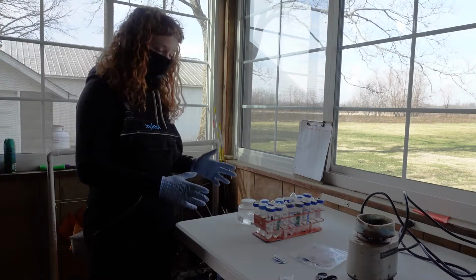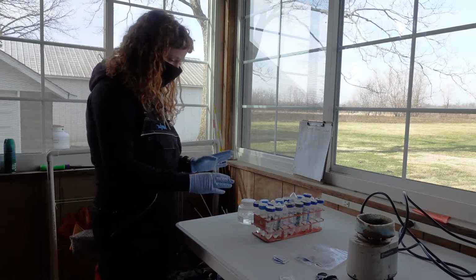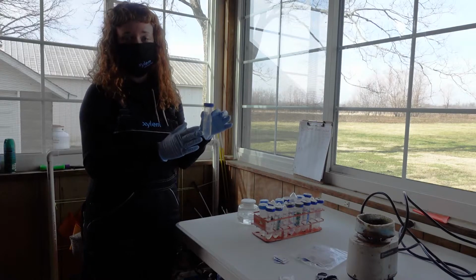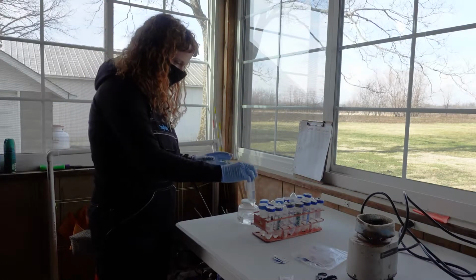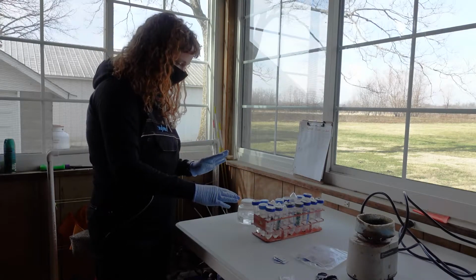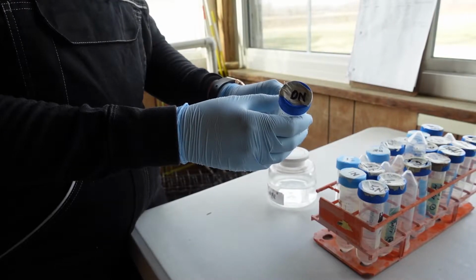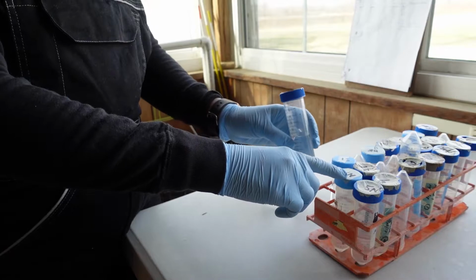So when you come in, your tubes for your nitrates analysis will be ready. They will be labeled. So we use a specific kind of tube for nitrates. It's a conical tube, and it is dedicated to nitrate testing. We do not mix these up with the other tests. There will be 4 kinds of labels that you will see on your tubes. The first are tubes that are labeled with a number and then an N. That's a standard. That's a reagent. And we'll talk about where we run those in the process.